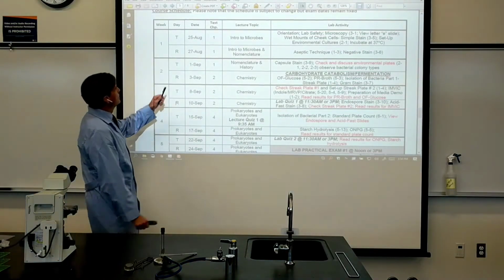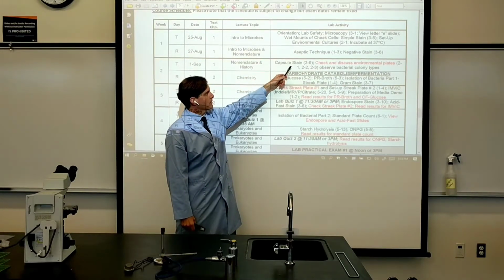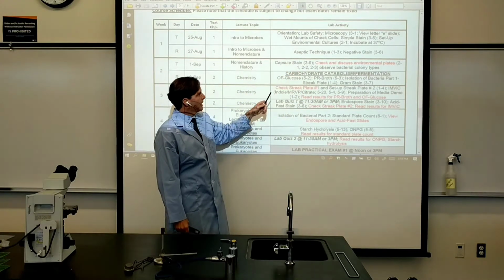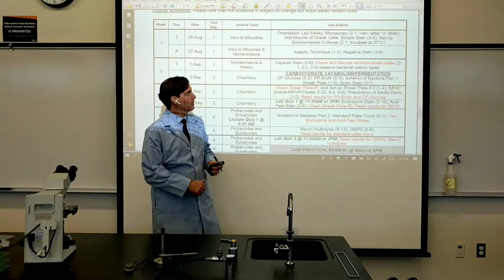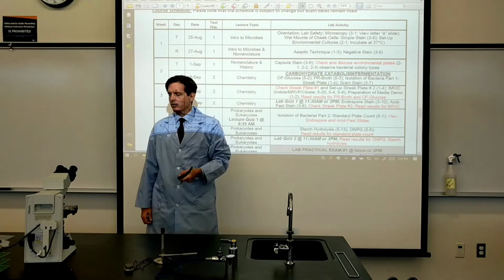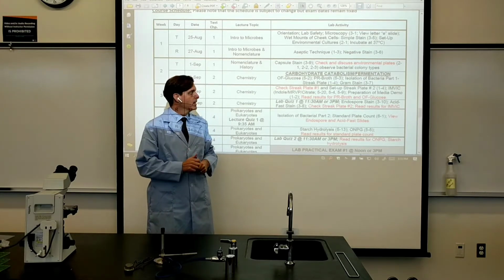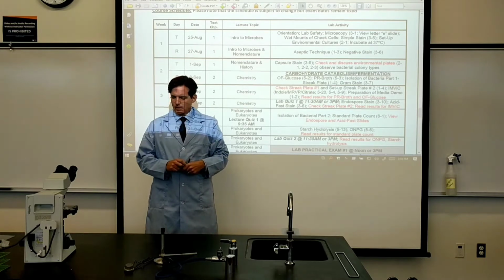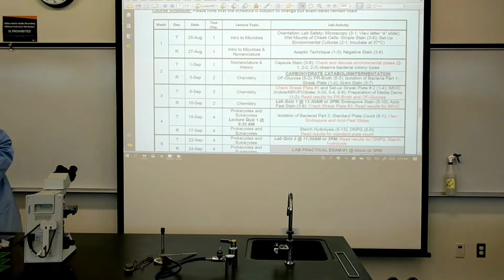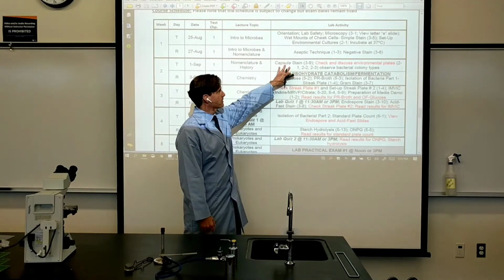The syllabus shows us here for September 1st, and so we have less to do than some days. The capsule stain, exercise 3-9, and then it says check and discuss environmental plates and observe bacterial colony types and fungal types as well. So we're going to be taking a second look back at the sample that I took from the bottom of my shoe, as well as the sample, what was the other sample? It was the shoe, let me check here. My shoe, and my cell phone. And then also the lab air. And so we'll be looking at those items.